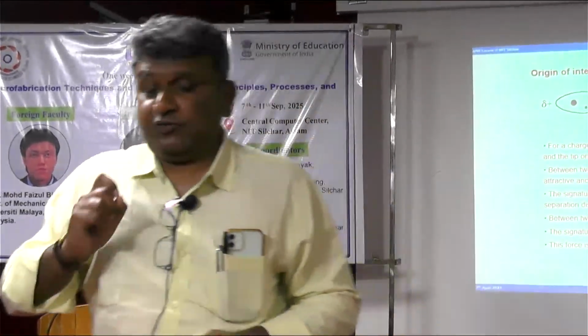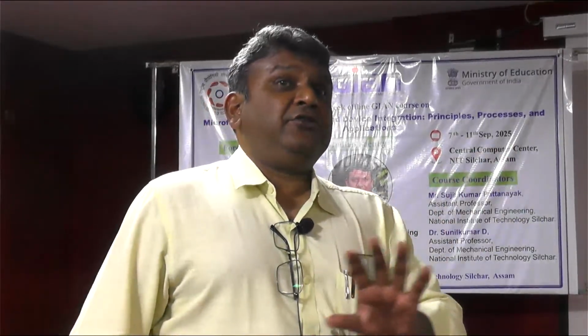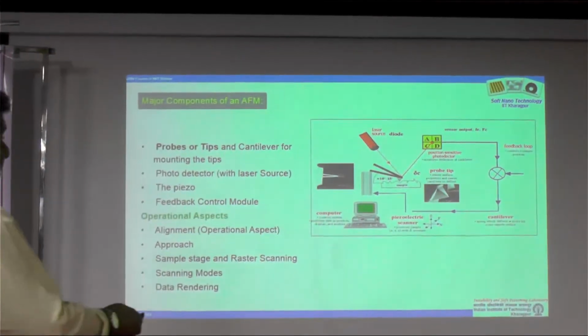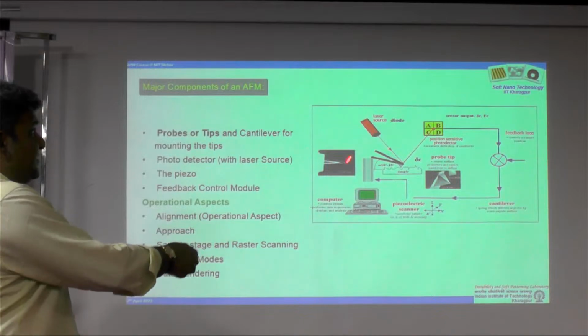Atomic force microscope. Now, why this word atomic force? Because this van der Waals force, based on which this microscope works, originates because of interatomic interaction. Therefore, the name atomic force microscope. This has nothing to do with nuclear reaction, which atomic energy, for example, typically refers to, right? So, conceptually this is fine. You will learn this in the next 15 minutes, and you will all understand.